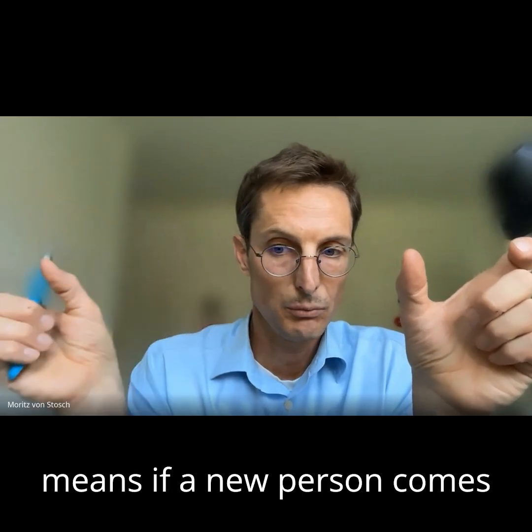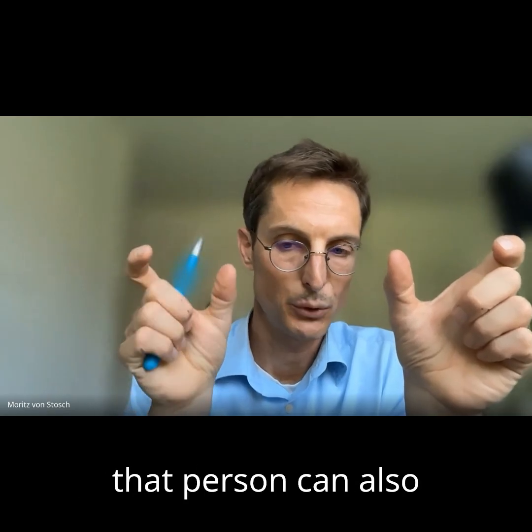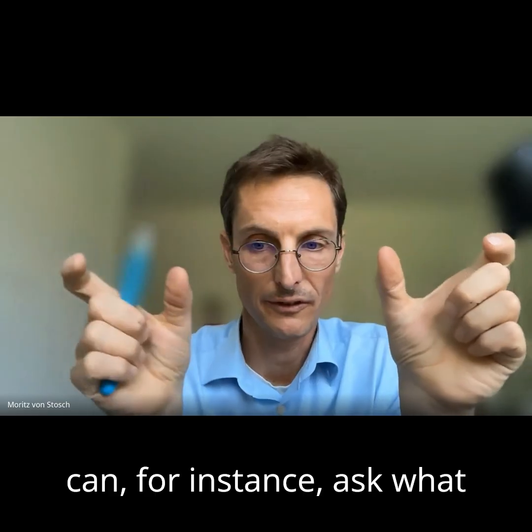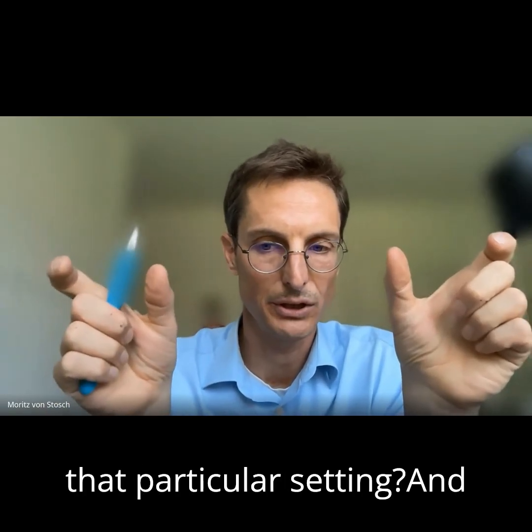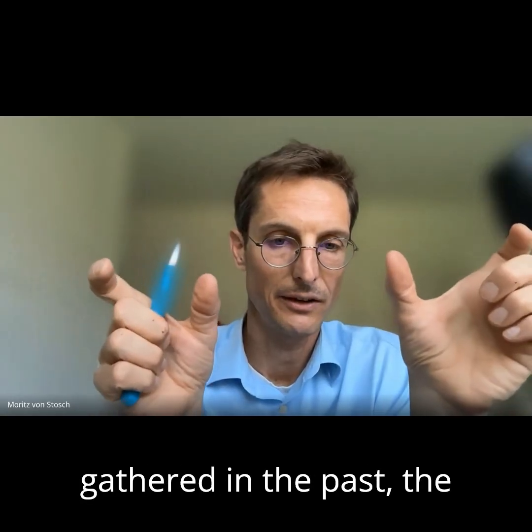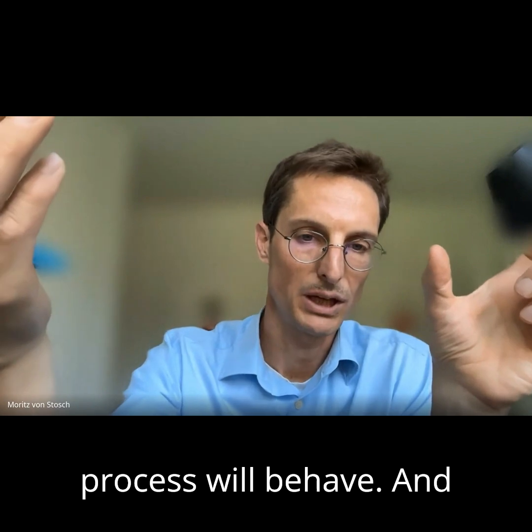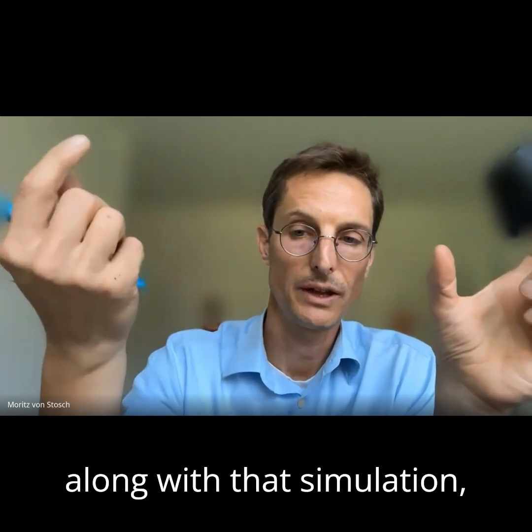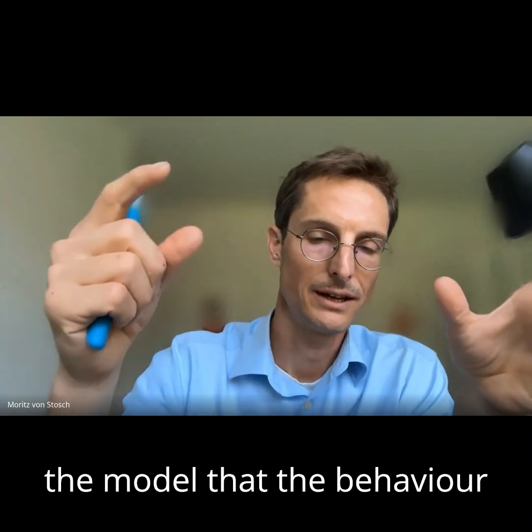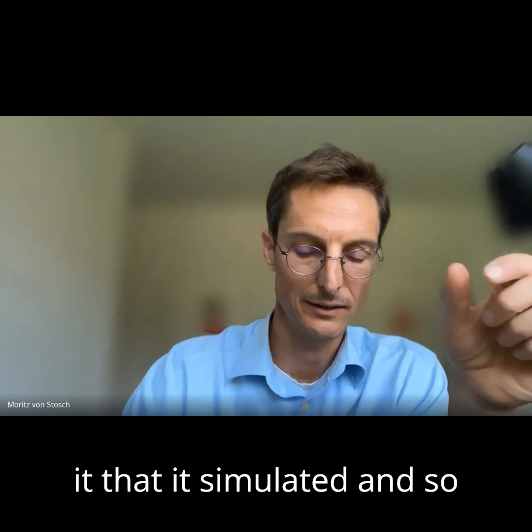And that means if a new person comes aboard, that person might read the documentation, but that person can also interrogate the model. They can, for instance, ask, what if I change temperature at that particular setting? And based on the data and evidence that has been gathered in the past, the model will simulate how the process will behave. Along with that simulation, there will also be a measure of uncertainty: how sure is the model that the behavior will really be as simulated?